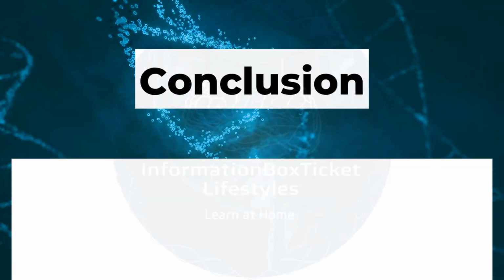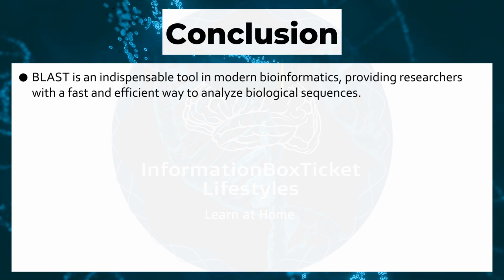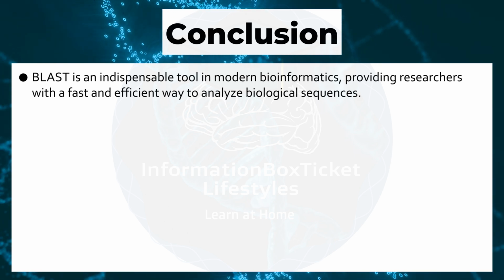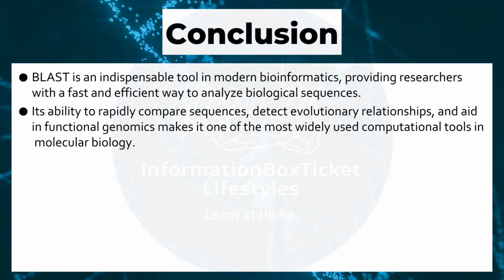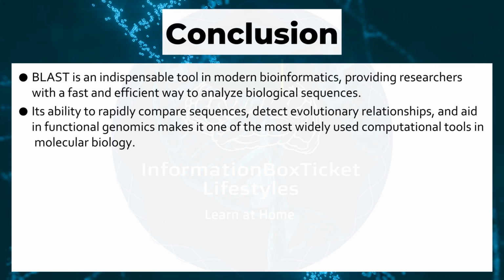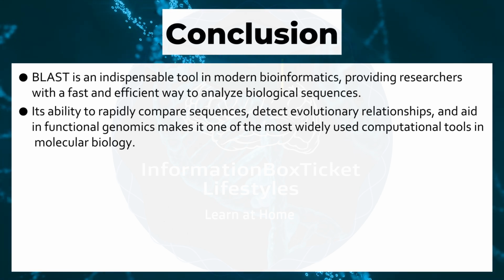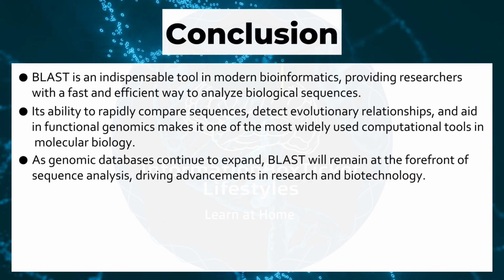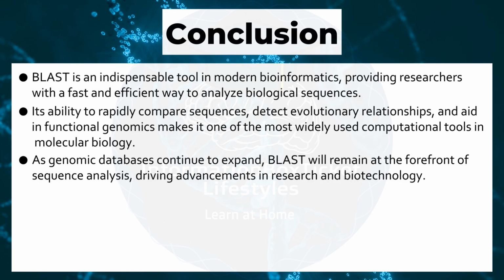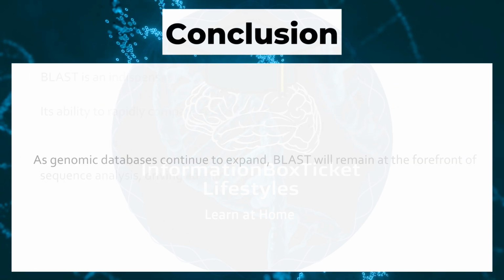Conclusion. BLAST is an indispensable tool in modern bioinformatics, providing researchers with a fast and efficient way to analyze biological sequences. Its ability to rapidly compare sequences, detect evolutionary relationships, and aid in functional genomics makes it one of the most widely used computational tools in molecular biology. As genomic databases continue to expand, BLAST will remain at the forefront of sequence analysis, driving advancements in research and biotechnology.